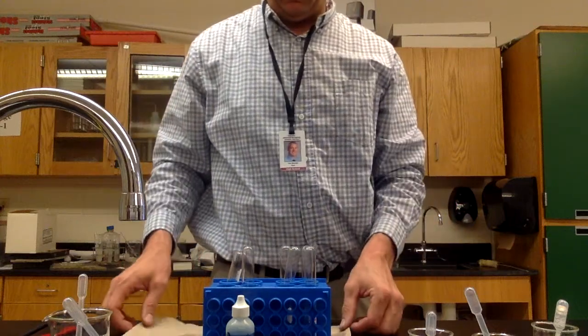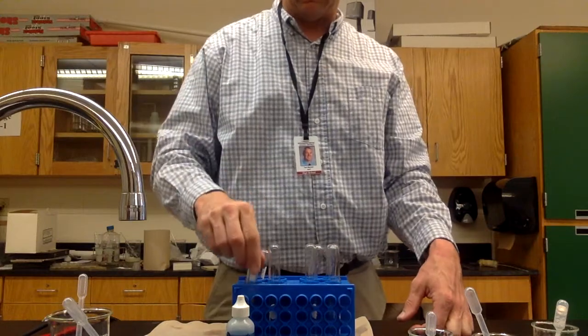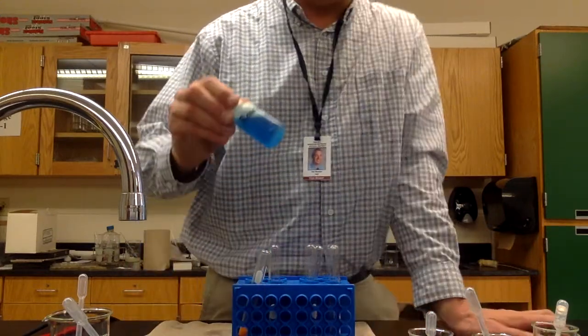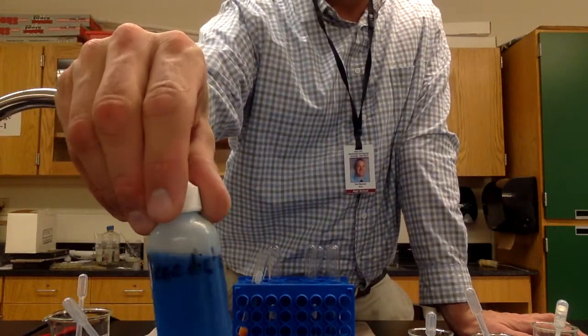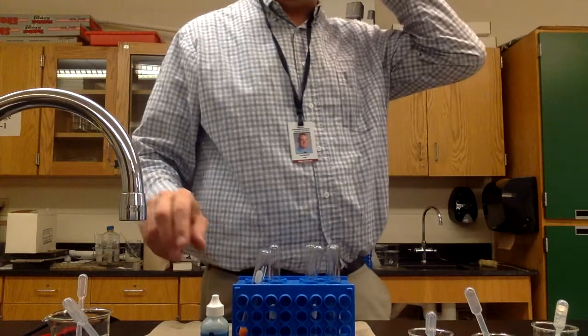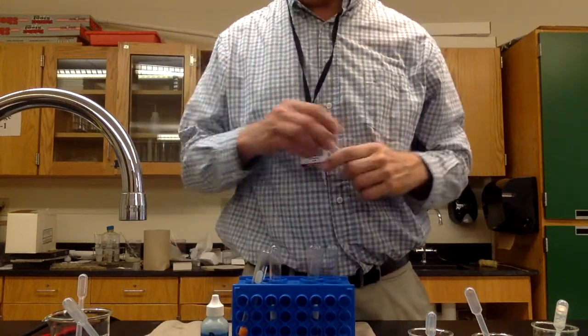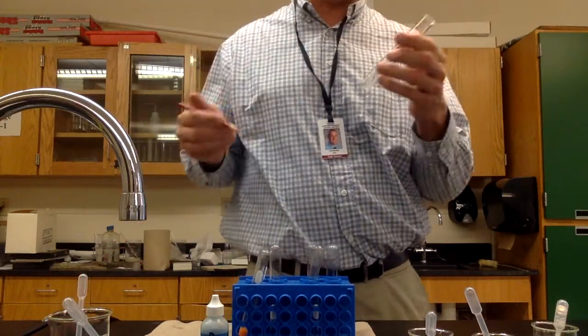Okay, now we're going to test for sugars. And to test for sugars, we're going to use Benedict's. Benedict's is the reagent we use to test for sugars. And we need clean test tubes for this. So make sure your test tubes are clean and dry, because otherwise if there's stuff in there, it could react.